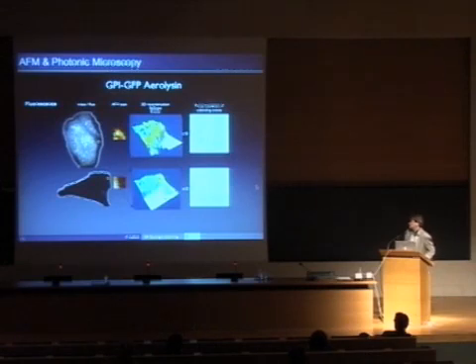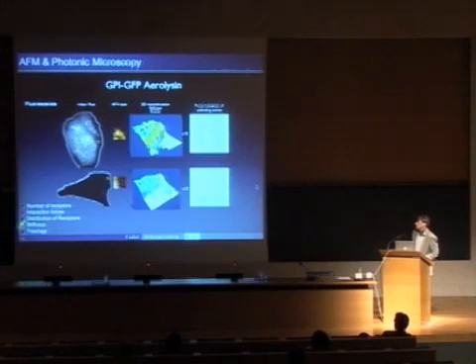We are not talking about affinity here. We are really talking about forces and the interaction between the aerolysin and the GPI-GFP chimera. So with one scan frame, you get the number of receptors and their distribution, the interaction forces, the stiffness of the structure, and the topology, which is quite a lot of information that you can use on top of the imaging study that you are performing in the lab using confocal or video microscopy.